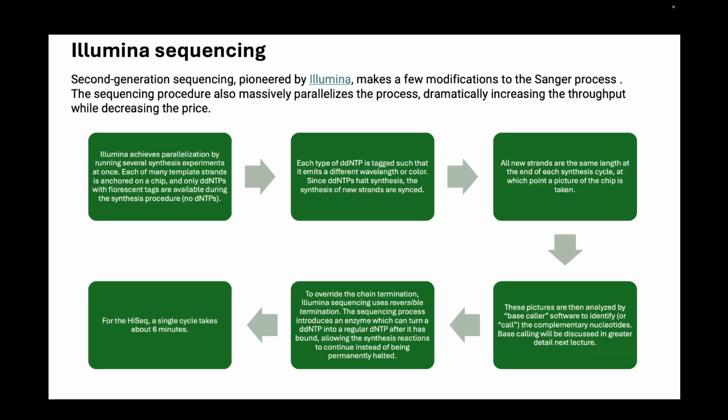Since ddNTPs halt the synthesis, the new strands are synced. All the strands are of the same length, and at the end of each synthesis cycle, a picture of the chip is taken. I'll show you how the picture looks, but bear with me till then.